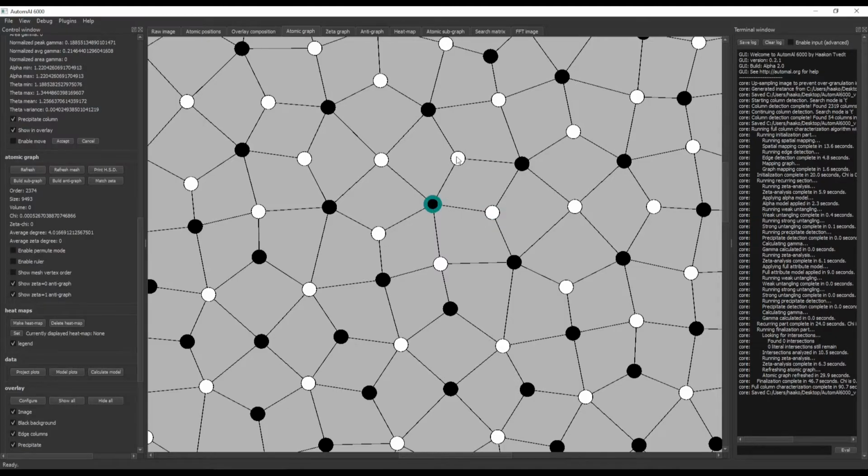But in highly ordered precipitates like this one, if it looks sensible like this, then it is usually correct, with the one exception that we can't see the difference between copper and silicon.